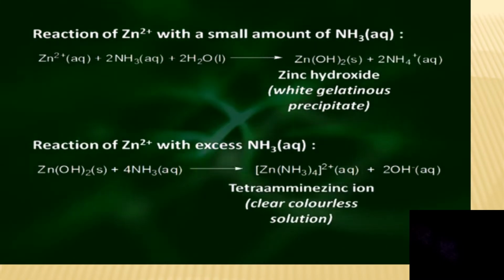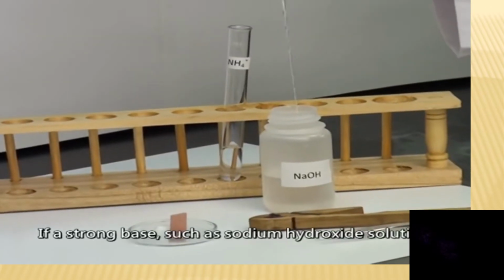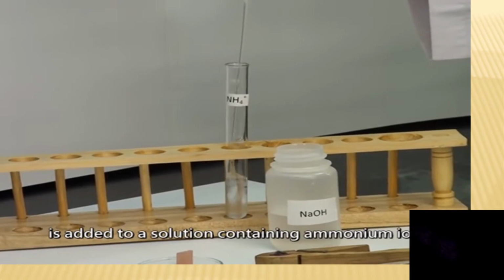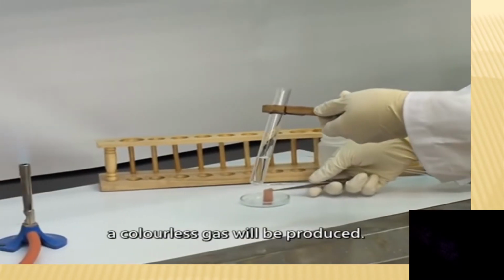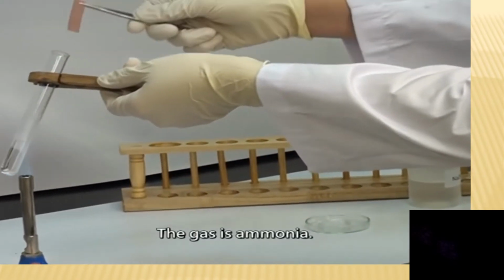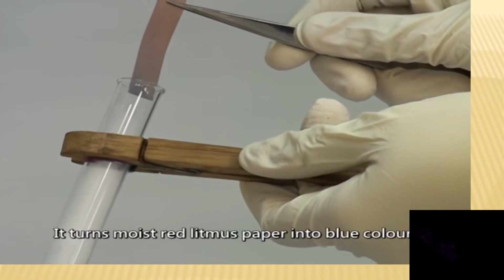Ammonium ion. If a strong base, such as sodium hydroxide solution, is added to a solution containing ammonium ion, and the mixture is heated, a colorless gas will be produced. The gas is ammonia. It turns moist red litmus paper into blue color.